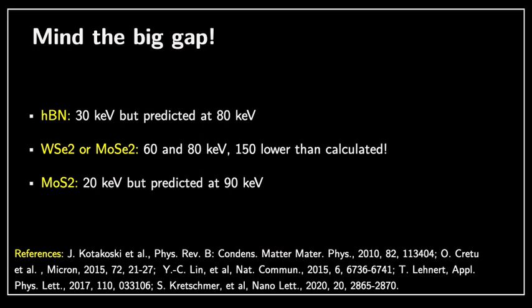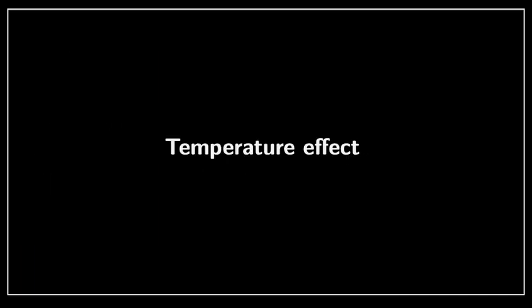Okay, now the first question you can ask is, maybe the issue is temperature. All those materials, all those experiments take place at fairly high temperature, certainly room temperature. Even though the models that I showed you are not temperature dependent. In fact, they assume T equals 0. All those suppose T equals 0. So maybe there is a temperature effect. Well, in the first reference I gave you, from Anthony, one of my former students in his thesis, he actually studied this, and here is the result that we have.